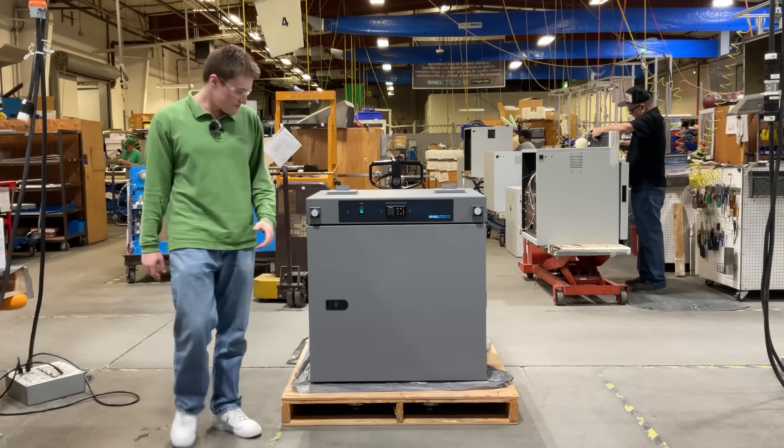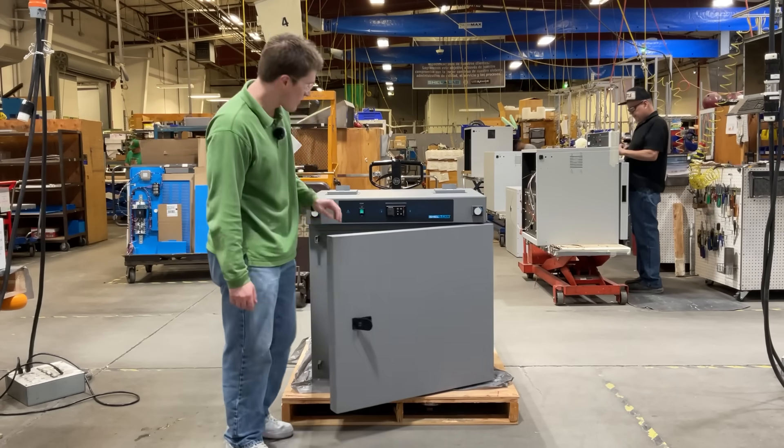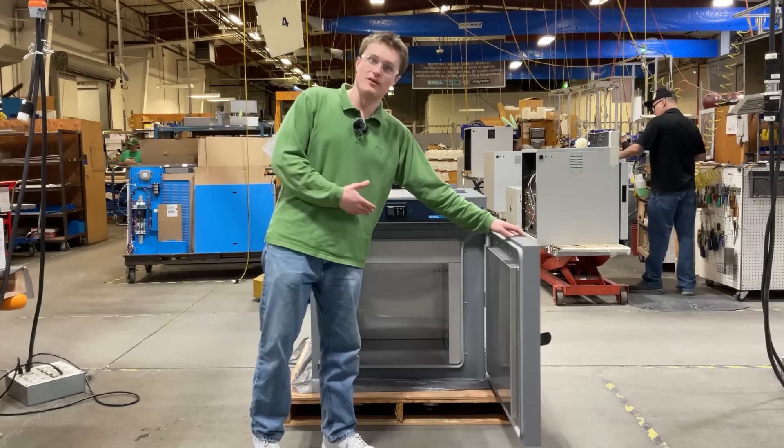Now let's take a look inside the unit. The first thing you will notice is the easy-to-use push-button door handle that provides minimal effort to open your chamber.